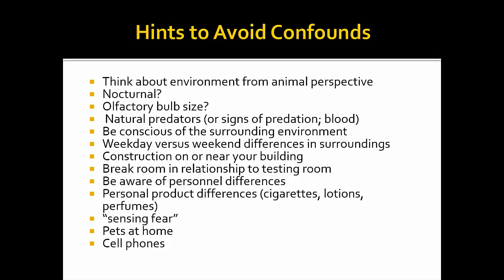Construction, food smells, perfumes. I try when I'm working with animals that I smell the same the whole time through with the animals. I use scent-free detergents, deodorants, no perfumes, no perfume lotions. I have animals at home. I have dogs, which are predators, and cats. So I make sure all my clothes, the animals don't sit on them. They're packed away in the drawers, that kind of thing.